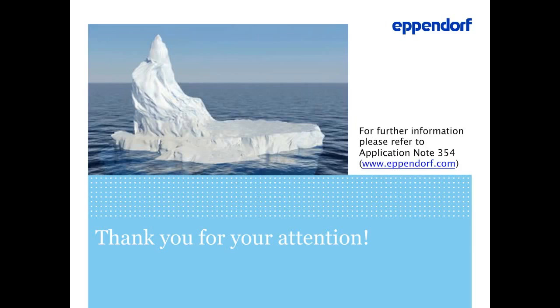Okay, yeah, I have come across this problem with some alternative tips, actually. With those tips, I found out that you have to pipette very, very slowly at the first 2 to 3 millimeters. So when the liquid rises in the tip, the first 2 to 3 millimeters, you have to be very slow. After that, you can be a little bit faster.